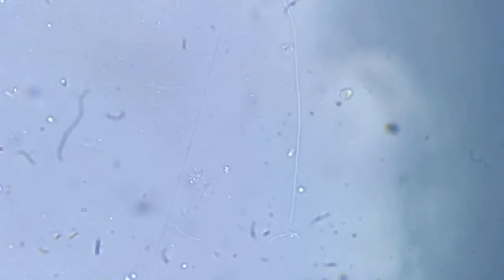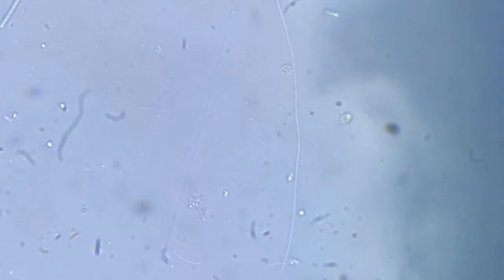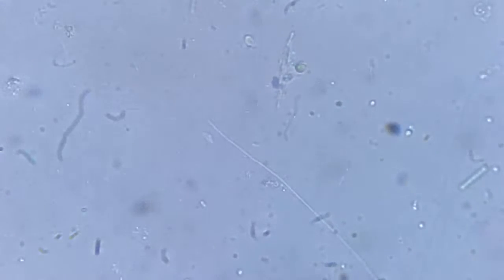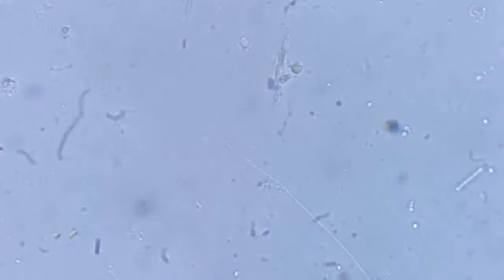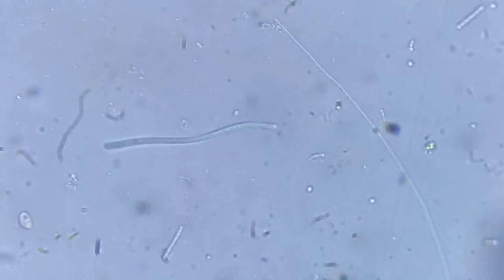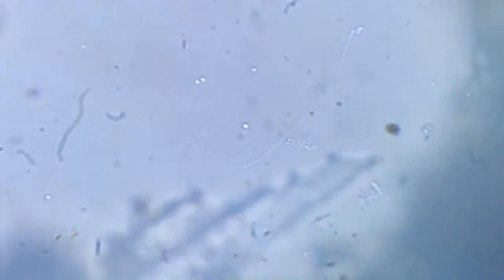Now I'll just run across the body. We begin scanning the entire length of the body. You see it? It's so tremendously long, just awesomely long. It's best seen in refracted light. See, it just went by. So this is one thing which I had never ever come across before, and I've just found it.